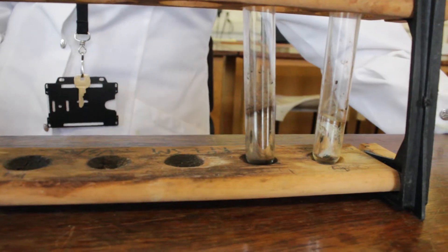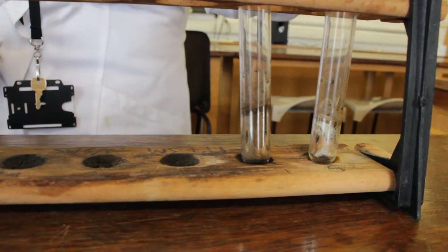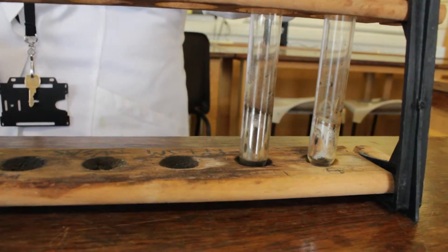Now today we are going to use an aldehyde which should give us a positive test in which a silver mirror forms around the side of a test tube.